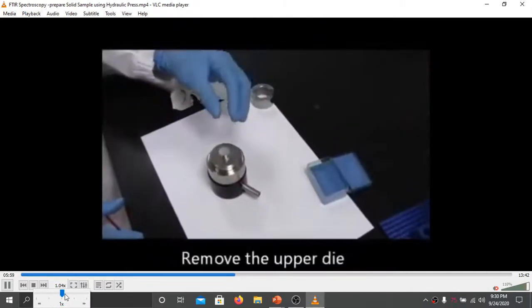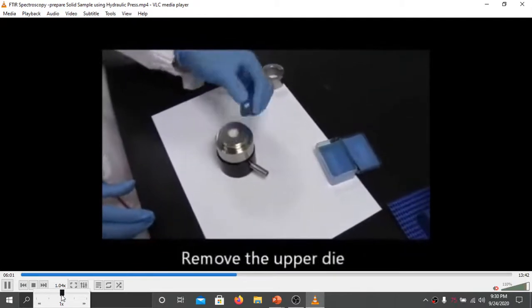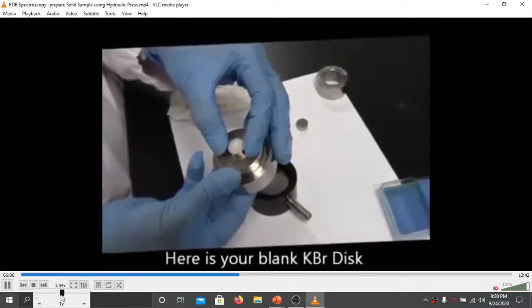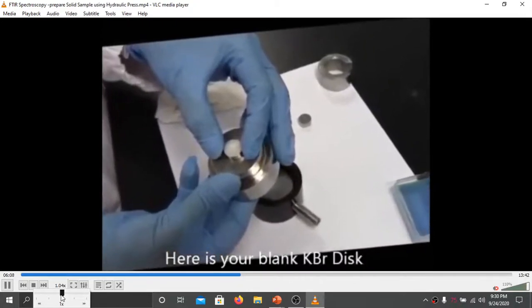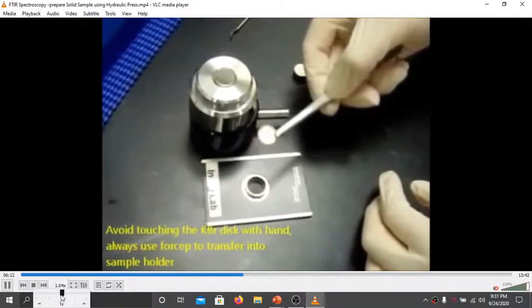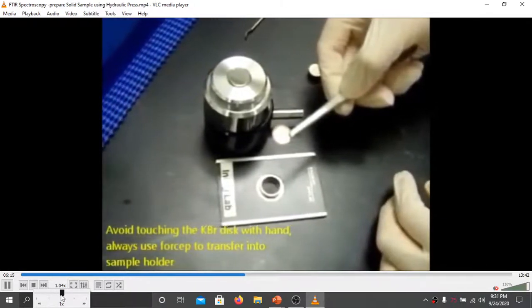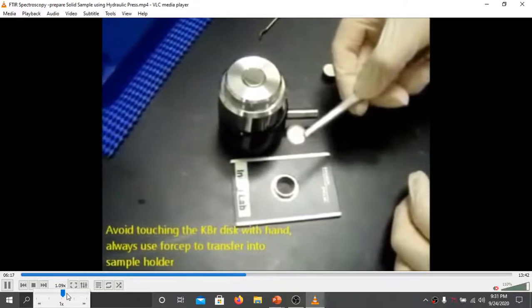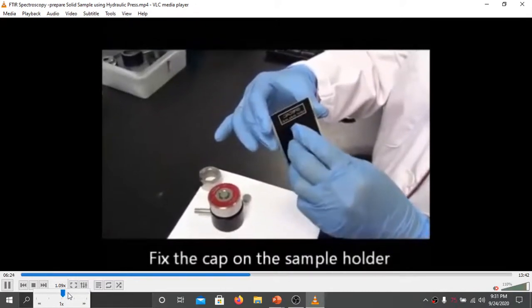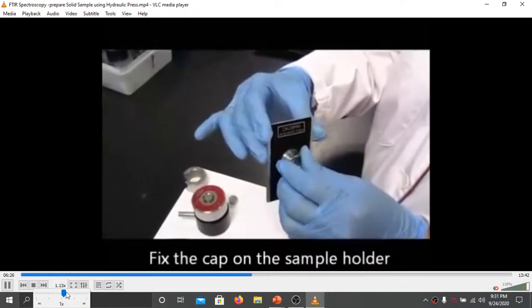So then it is removed. See, this is the KBr disc. This is the first die removed. Again, the bolt is pressed so that the other die will come out, showing you the small KBr disc, which is then placed into the holder. We have seen the holder. Screw cap holders are shown here. It is placed into the holder, screw capped, and then kept in the instrument for recording of the background.